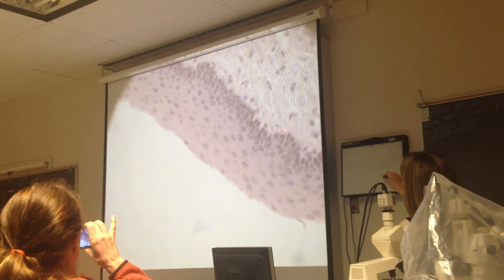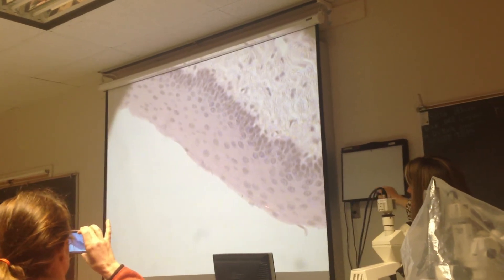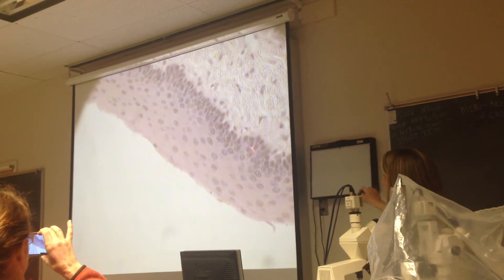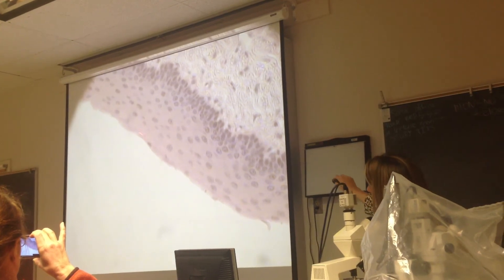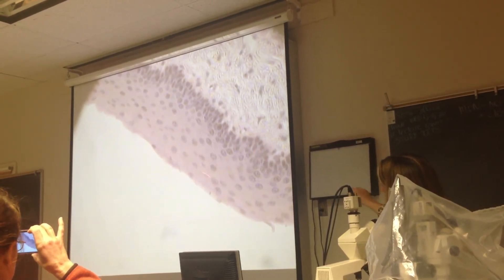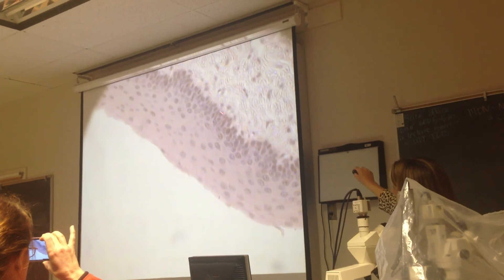Down here, here's where it changes the tissue type. So what kind of tissue is this here? Connective tissue. And what kind of tissue type is this here? Stratified squamous. And is it keratinized or non-keratinized? Non-keratinized. As the cells get further from their underlying connective tissue, they get more dried out, kind of flat-looking out here. So here's where the regeneration is occurring down here.